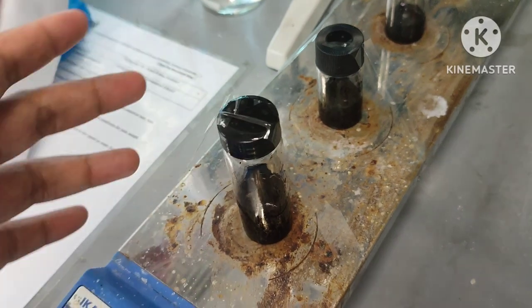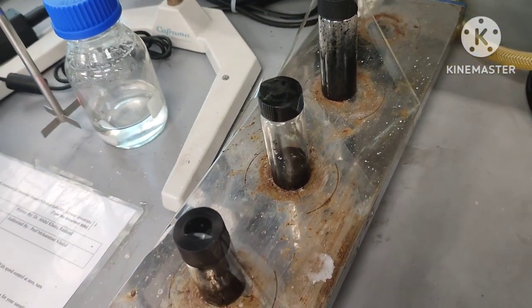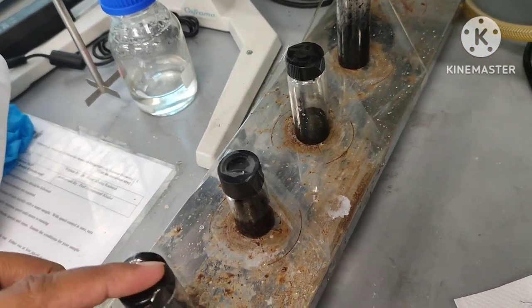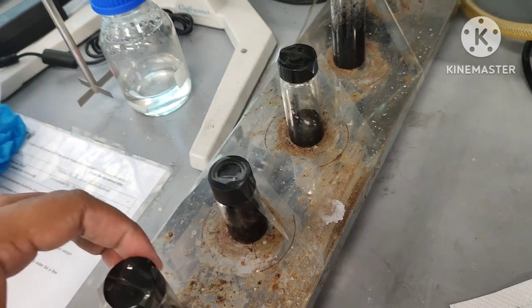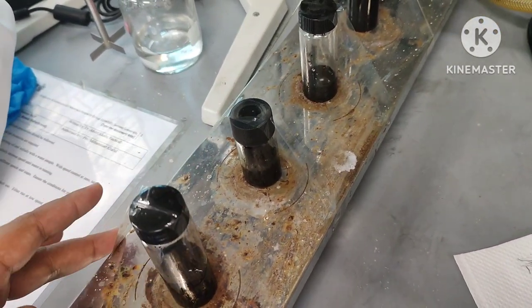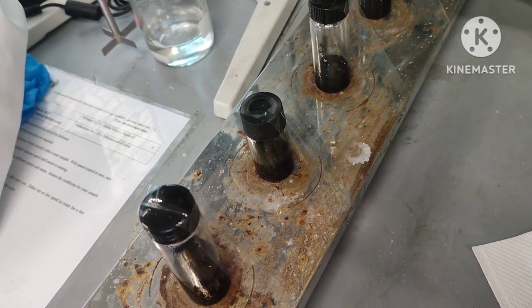This is the slurry that we prepared. Make sure when you are dealing with slurry, it is not too thick, not too viscous, and not too watery. Make sure you have a good slurry — not too viscous and not too watery.